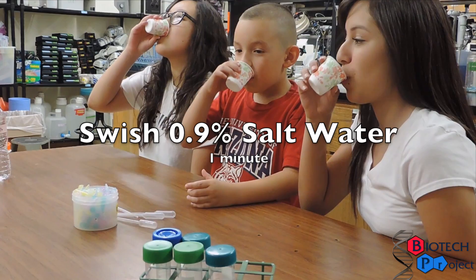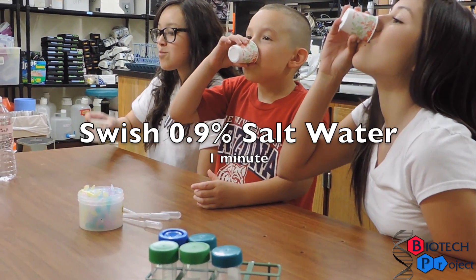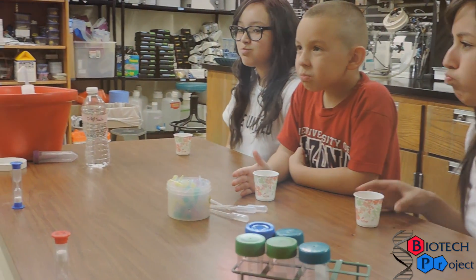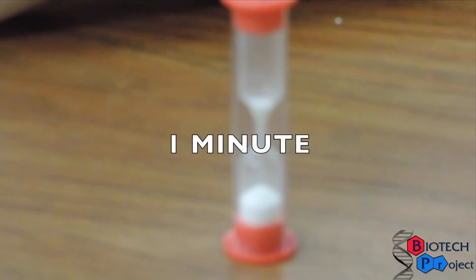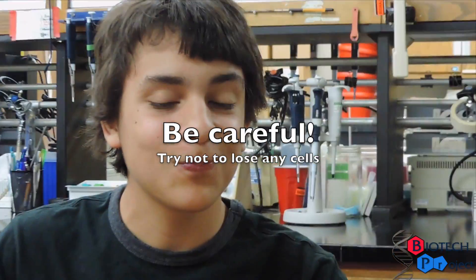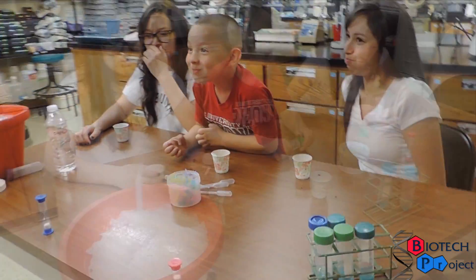To begin extracting DNA from our cheek cells, we'll swish a 0.9% saltwater solution to make sure that our external membrane stays intact. This swishing should happen vigorously and continuously for one whole minute. Be careful not to lose any of your sample.